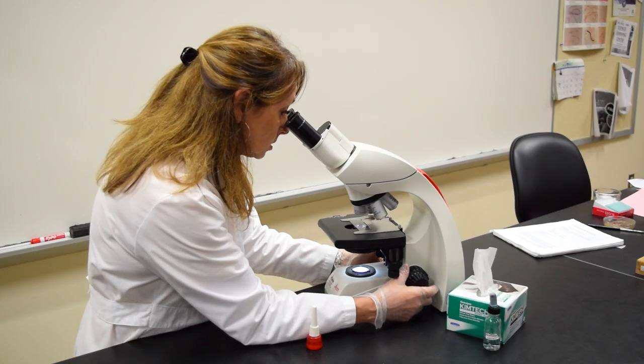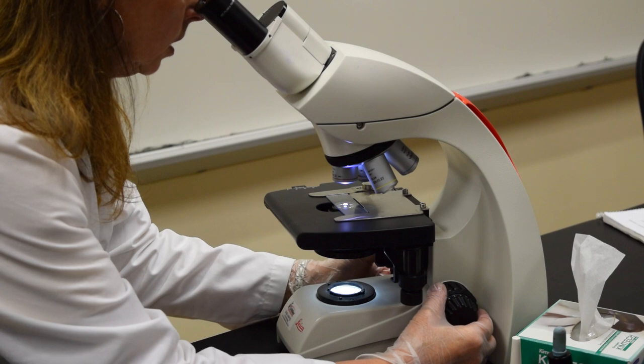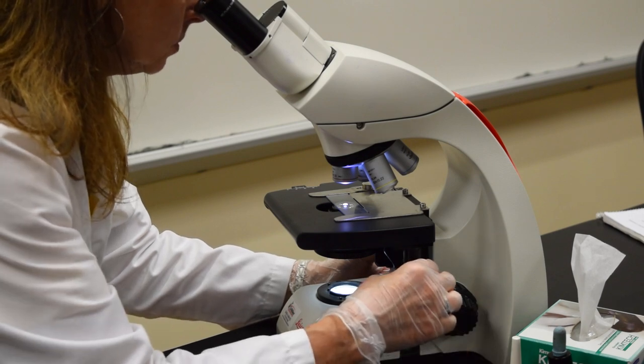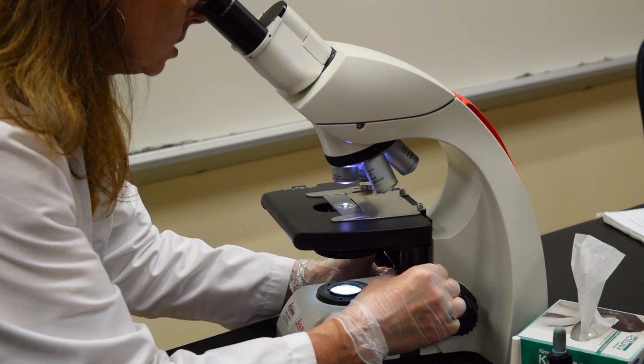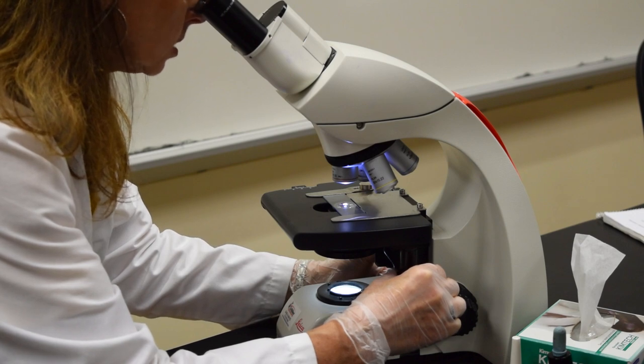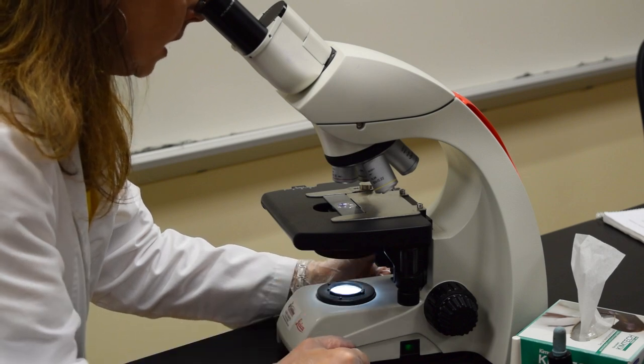Begin to take a look at the slide. When using your scanning power you're going to use your coarse adjustment knob to get it in focus. If your stain is very thick and dense you need to move to the edge of the smear so that you can see individual cells against a white background. When looking at stained slides you want to make sure that your iris diaphragm is open and the background is nice and bright.